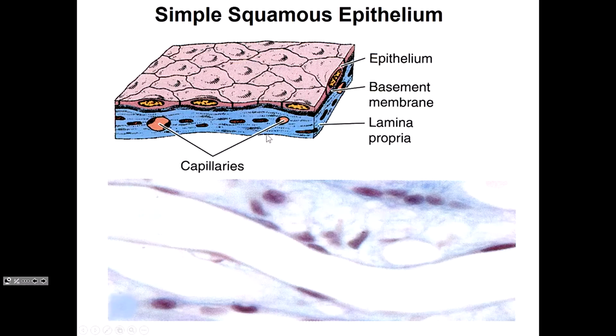The very first slide? Basement membrane is here, this kind of darker. Yeah. The basement membrane is always on the bottom of the layer. Oh, down here? This looks like a blood vessel. You can't make it out here. This is the nuclei and a fuzzy image of cytoplasm. You can't make it out because it's a low level of resolution for that slide.